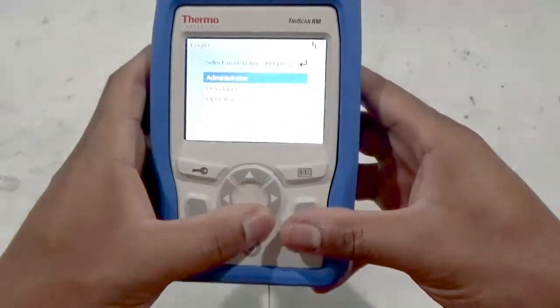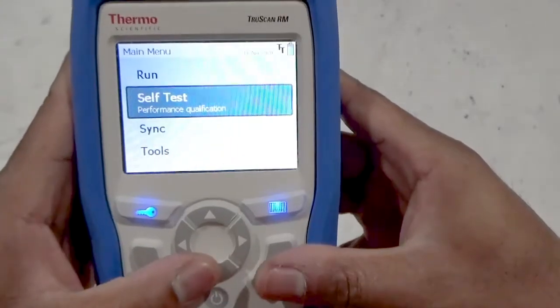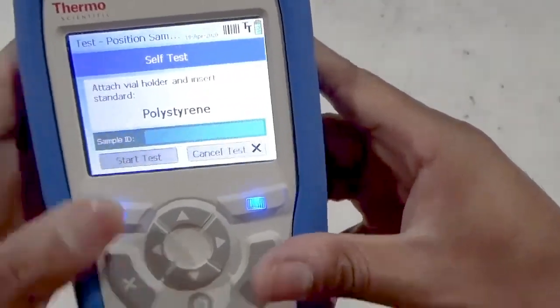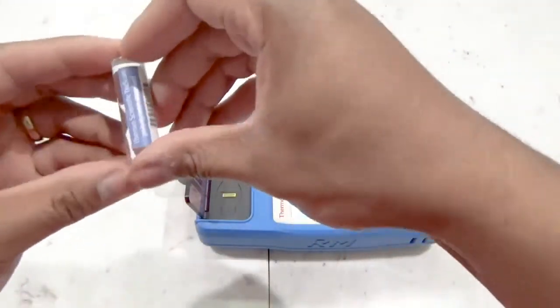For now, let's try to identify a sample using a developer account. Let's start with the daily self-test or performance qualification. The TruScan, by default, uses a polystyrene standard to ensure the instrument is suitable for analysis.